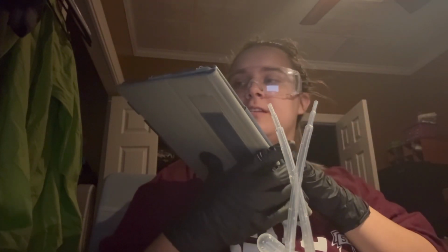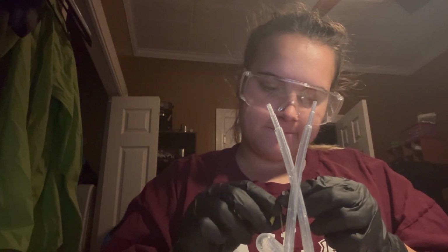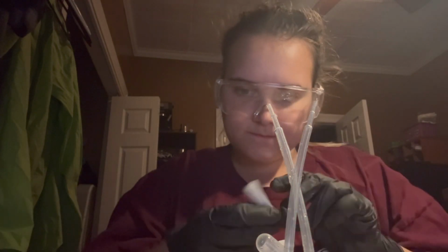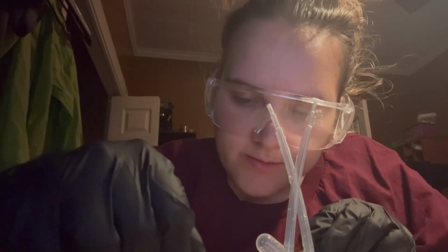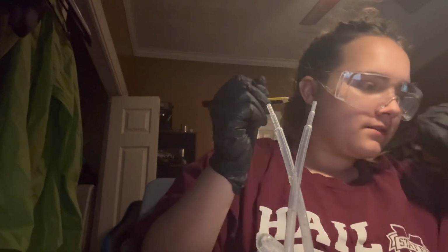So now we'll measure the pH of the C6, and here's my results from the previous. Alright, so now let's measure the pH of C6. So the pH seems to be around a 7. So neutral for distilled water.